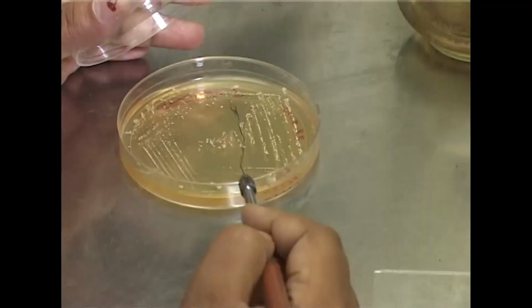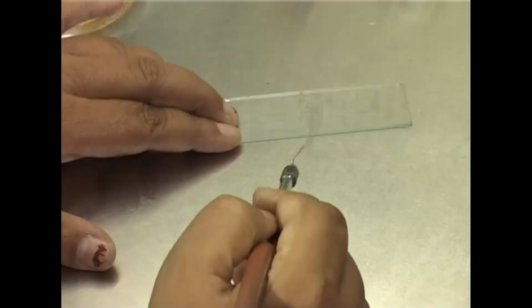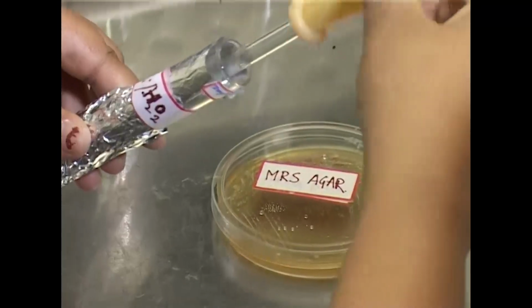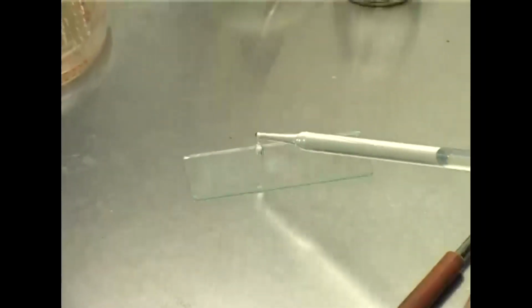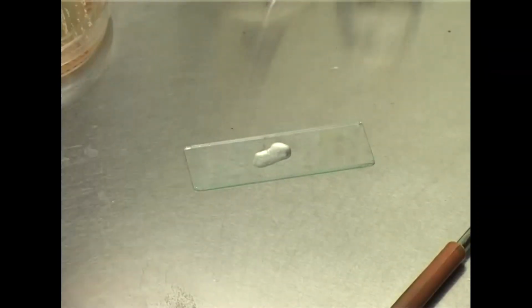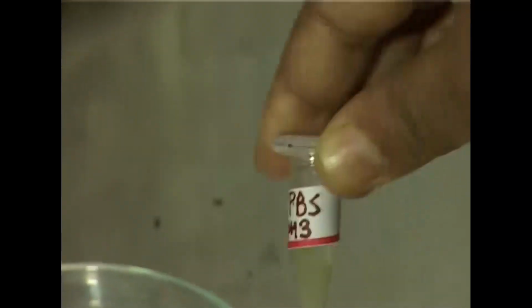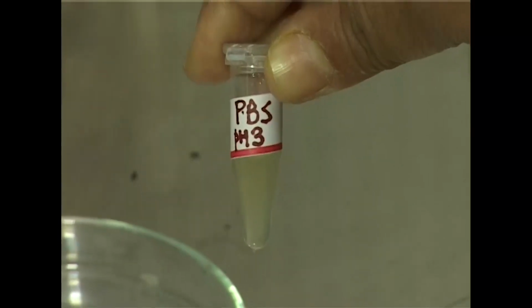Now, isolated lactic acid bacteria from the curd will be confirmed by being catalase negative, so you cannot see any effervescence, as well as gram-positive bacilli will be observed under the microscope. Next, probiotic properties, resistance to low pH. So you can observe very efficient growth in very low pH like pH 3, because you know that lactic acid bacteria can withstand very low pH when it exists within the stomach.